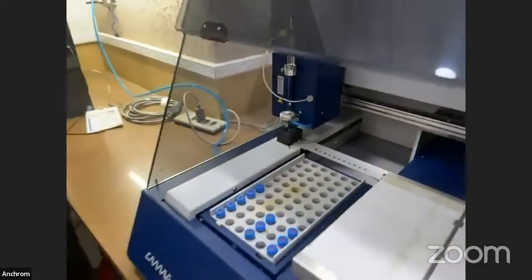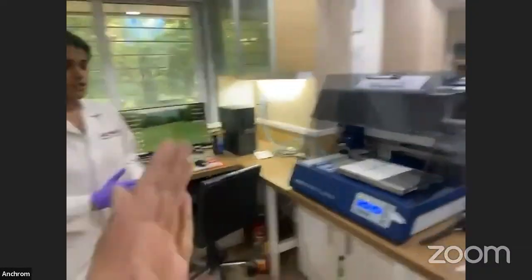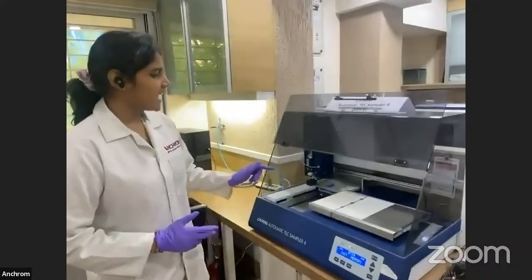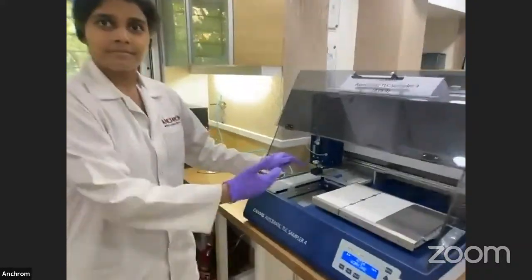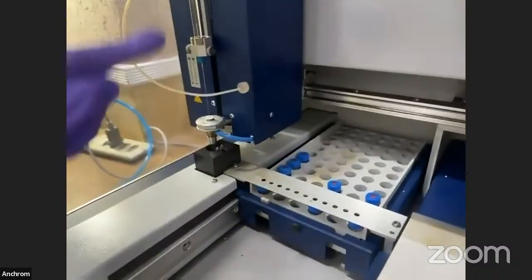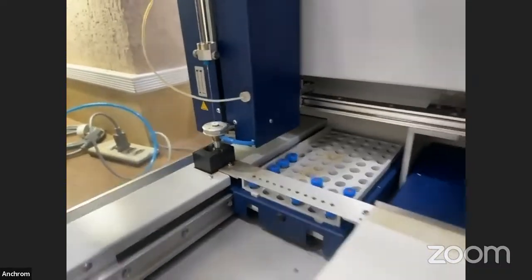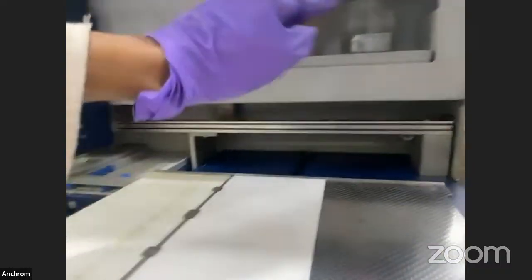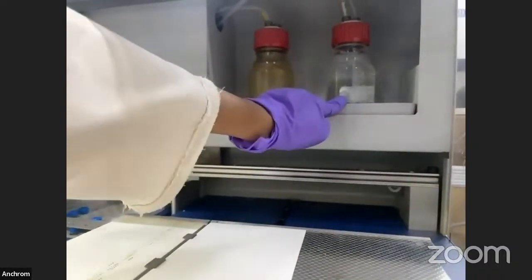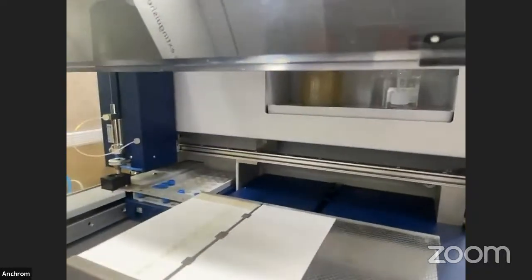This is the CAMAG Automatic TLC Sampler 4, which is used for sample application. You can see I have kept my samples in the A1 rack. There are 5 different samples. With the help of the syringe, the samples will be applied onto the stationary phase. Also, you can see there are 2 bottles: one is the waste bottle and the other is the methanol bottle for rinsing of the syringe.